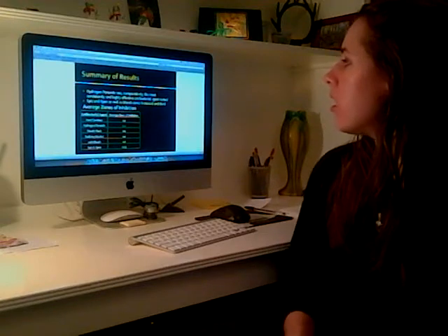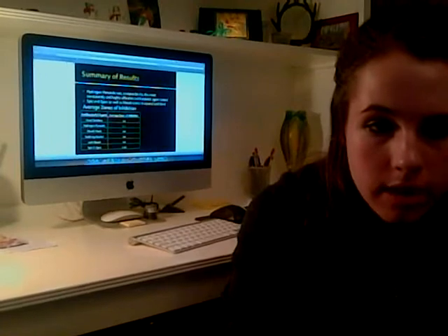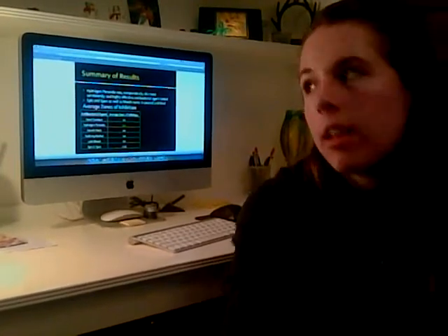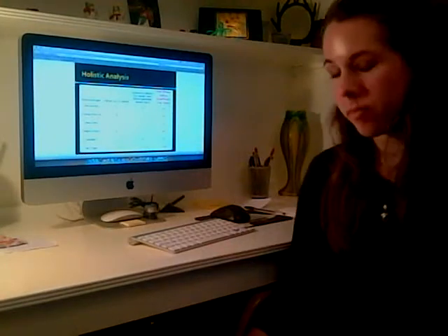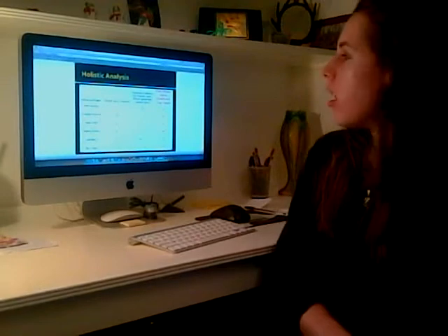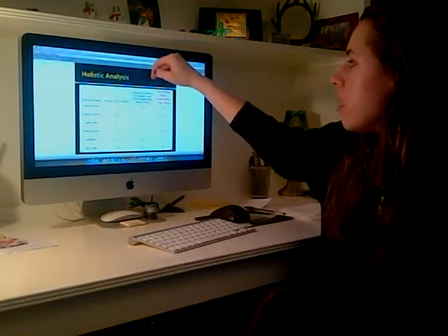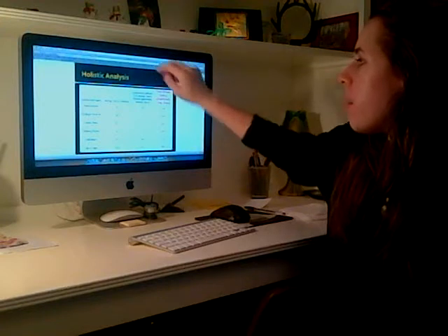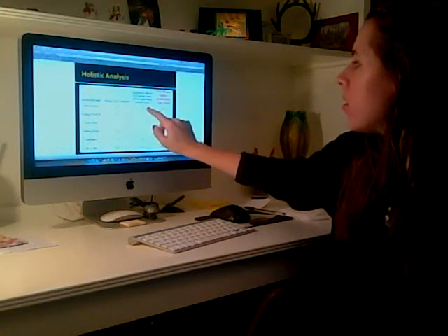strain. So to make the numbers reflect the consistency as well as the size of the zone of inhibition, I put a consistency coefficient and multiplied it by the average zone of inhibition.